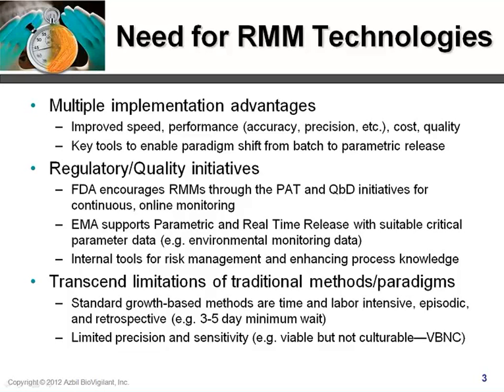This paradigm shift is also supported by several regulatory and quality initiatives around the world. Here domestically, the FDA encourages rapid micromethods through a couple initiatives. One of them is PAT, which stands for Process Analytical Technologies, and also the QBD, which is Quality by Design initiatives for continuous online monitoring of one's manufacturing process.